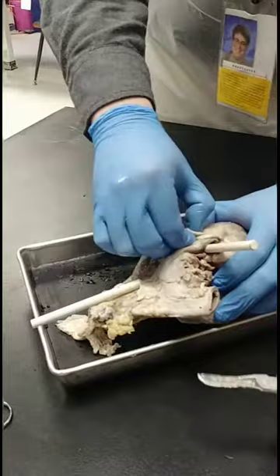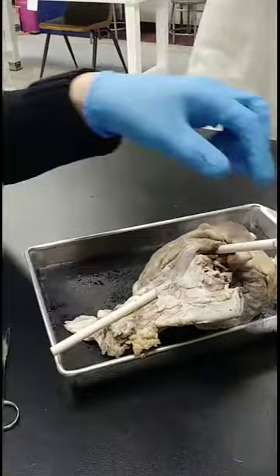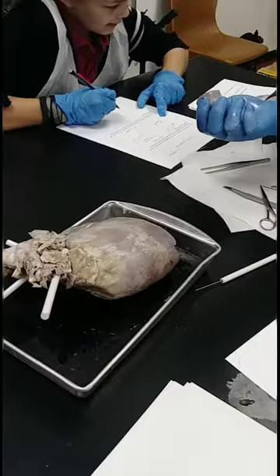You can take your scalpel and start cutting into that groove, the interventricular groove. That's part of the inner pericardium. We don't have the complete pericardial sac, which would be a layer over this full of fluid to protect the heart. But we have part of it, that membrane on top.